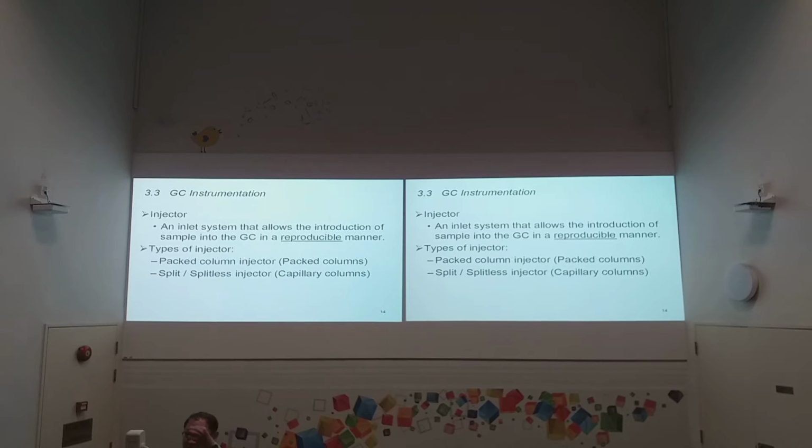How to prepare it? Actually, it's not very difficult. We just get a tube, whether it's a glass tube or a metal tube. The tube is not very big; in terms of diameter, it's somewhat similar to this or slightly smaller. I take the tube and put in the packing material. It can be fine particles with certain chemical properties, or even quartz wool.